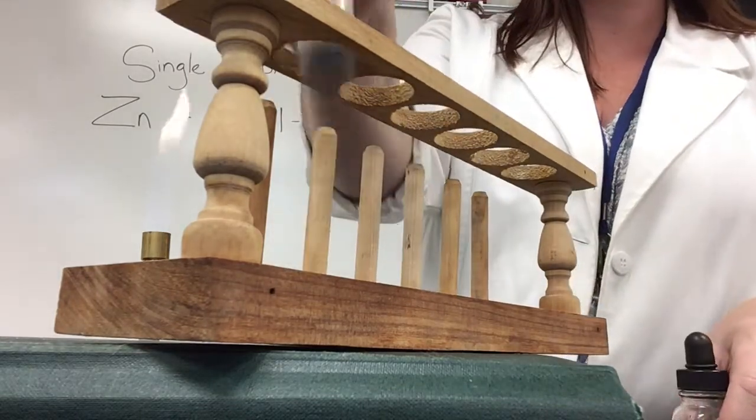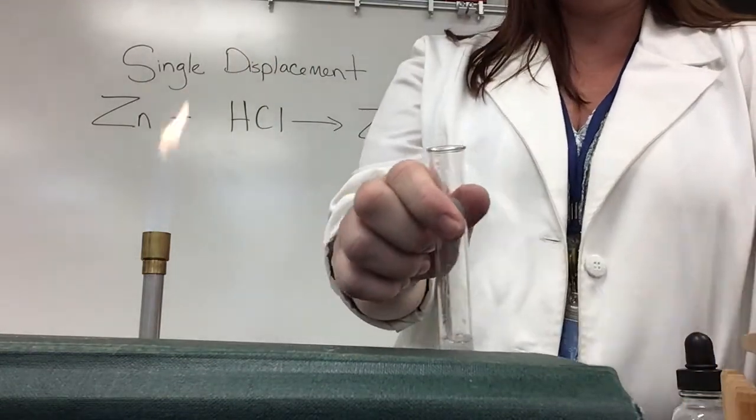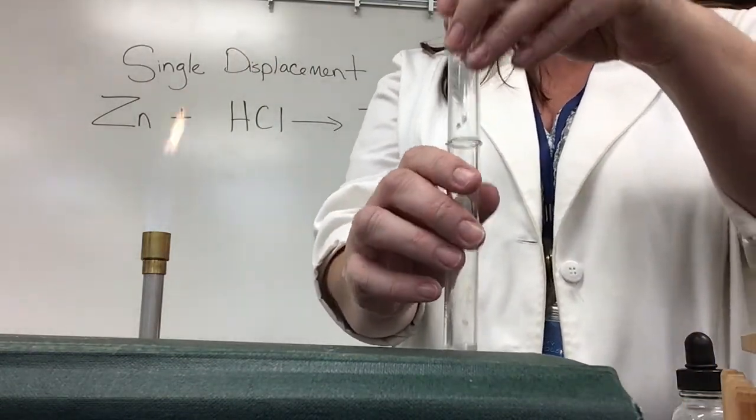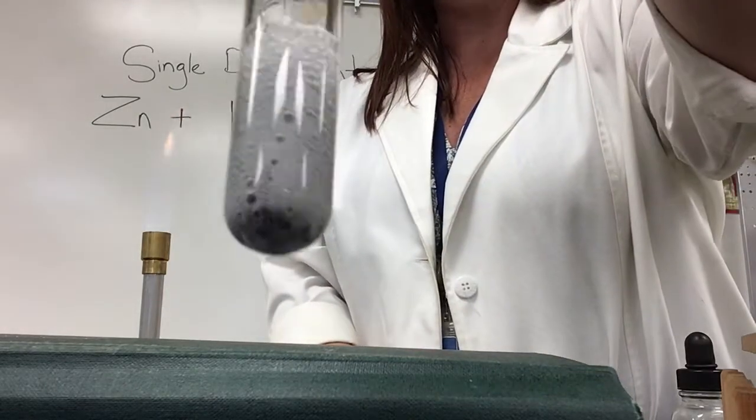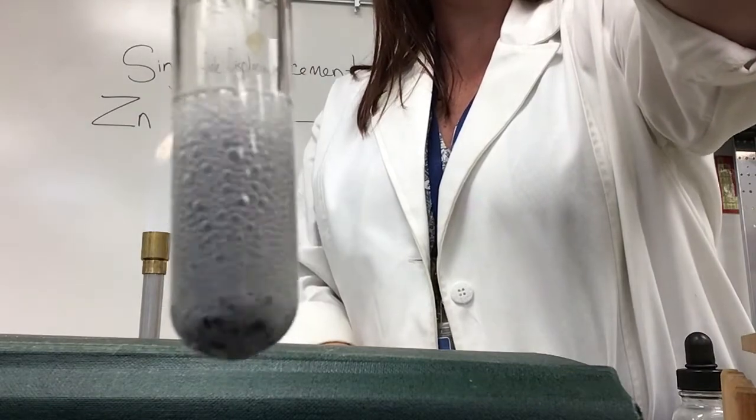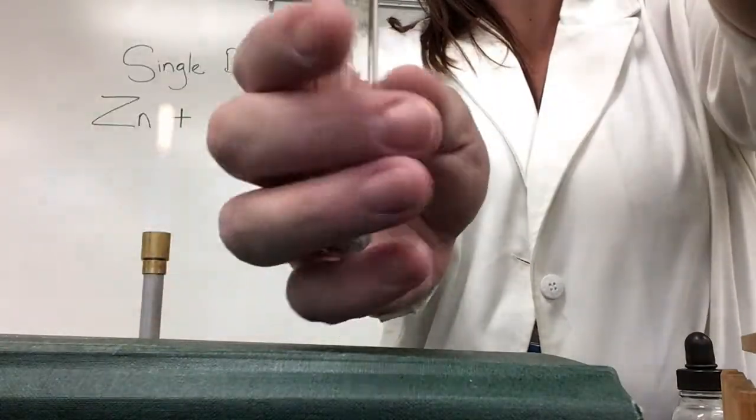Now this vapor is coming out the top. I'll show you that and I want to trap that. So I'm going to invert another test tube on top and try to capture that vapor while we look at this reaction. So I see lots and lots of bubbles. Let me touch it. Oh my gosh.